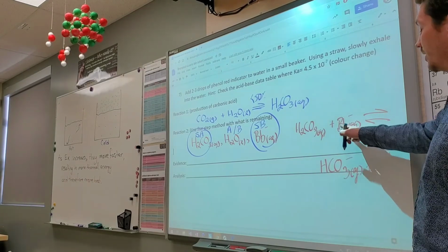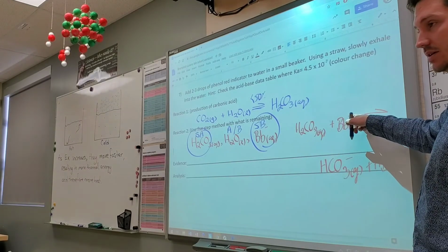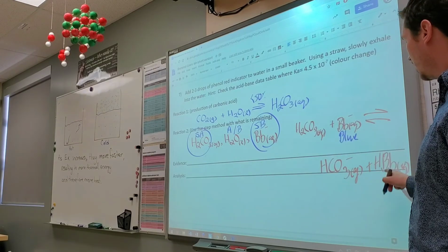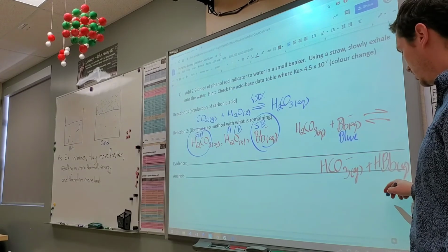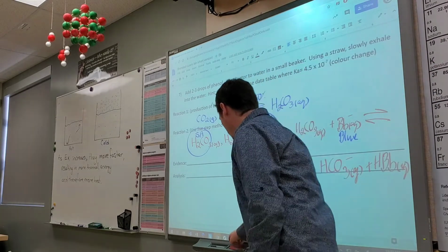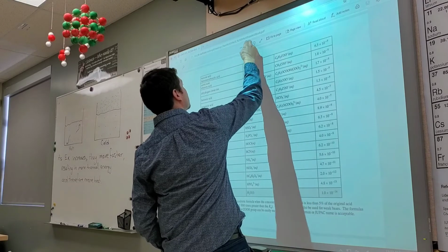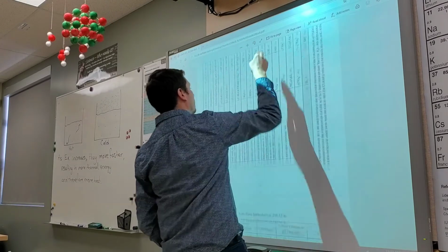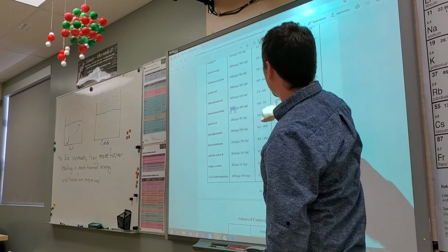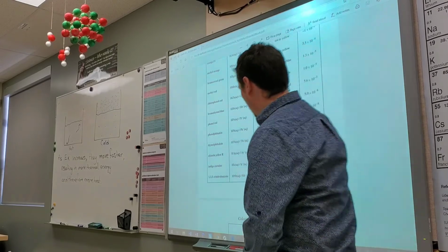What's the color of BB minus? Blue. What's the color of HBB? Let's take a look. It should be yellow, right? When I look at HBB, it's yellow, right?